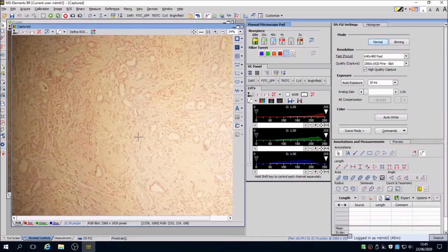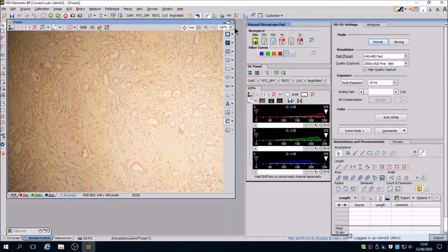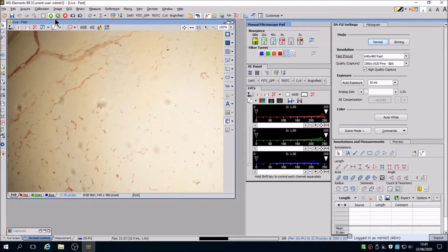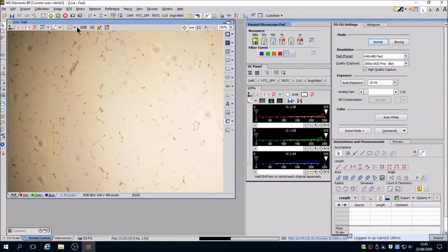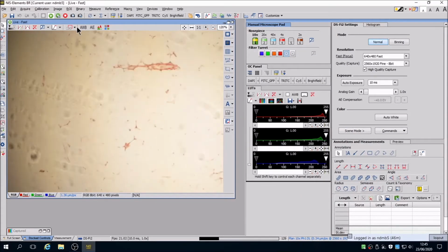You will notice in this case that this histology slide image has a color tint to the lighting. So to remedy this, move the region of slide away from your sample. Go Live View again, and once you have a region clear of tissue, press the Auto White Balance button on the Camera Setting tab in the software.